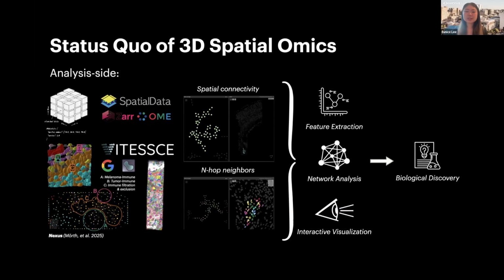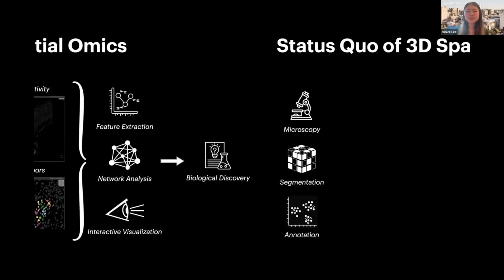And all of this now leads us into biological discovery just by being able to have those data sets in 3D and then be able to analyze the data and extract the statistics out of it, which is essentially how we're driving everything into the 3D space further, since biology is simply put 3D.